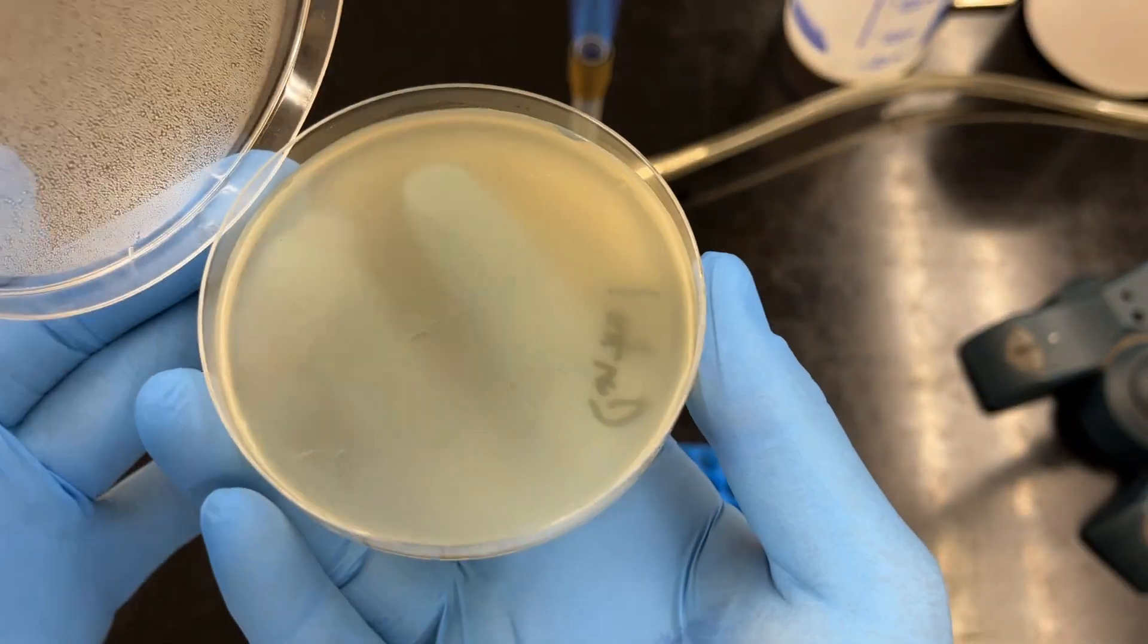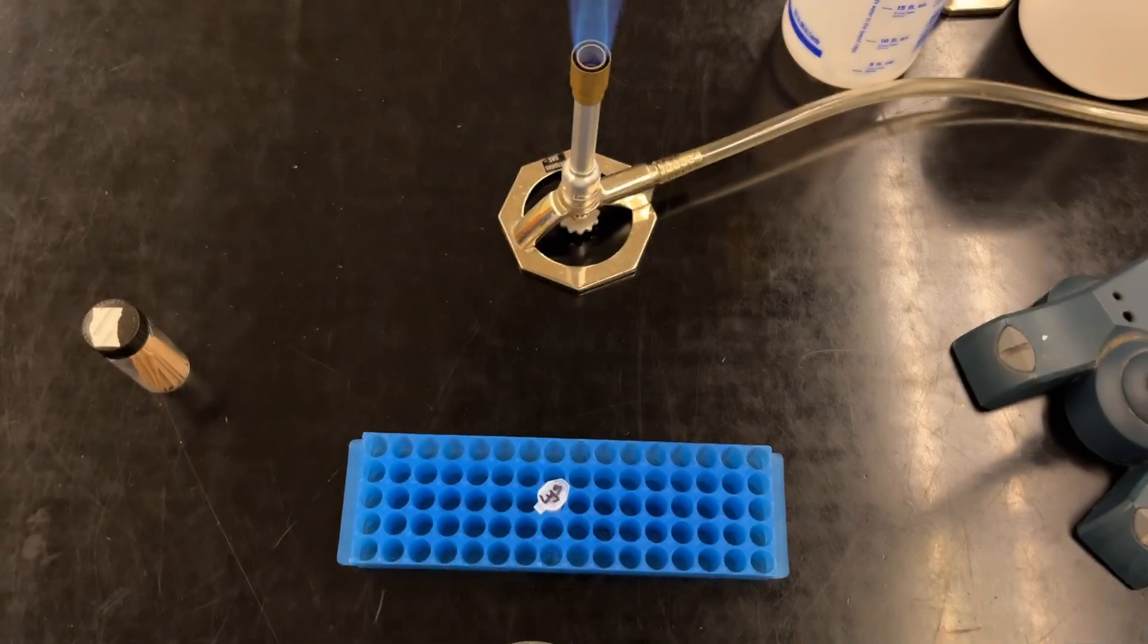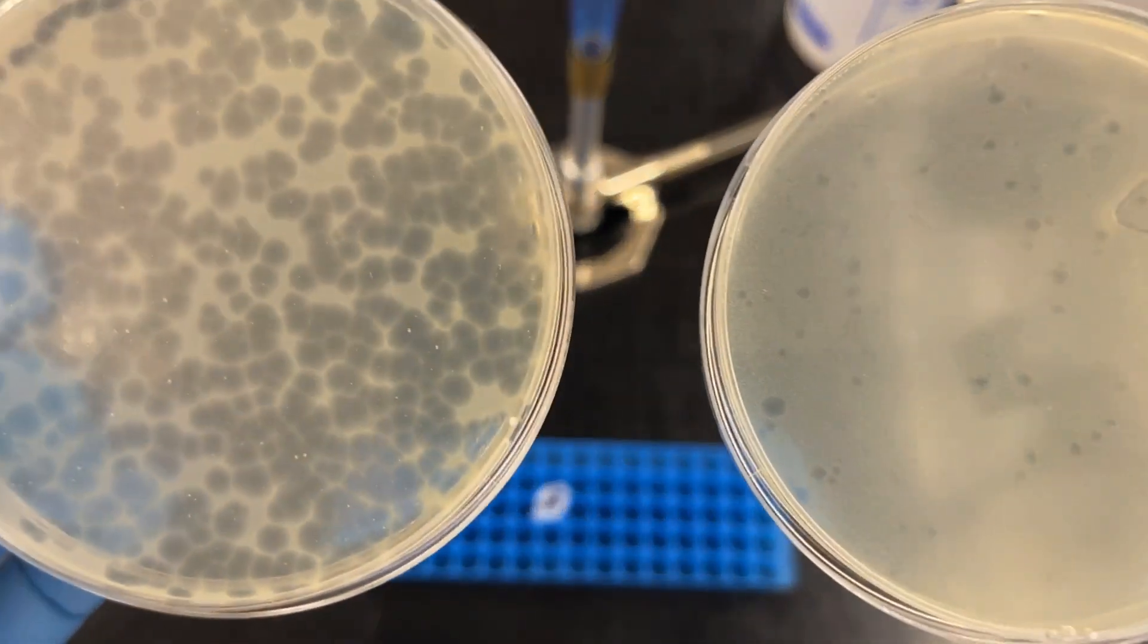So here is a lawn of a bacterium without any phage. And when we add phage to it that can infect this bacterium, this is what we see.